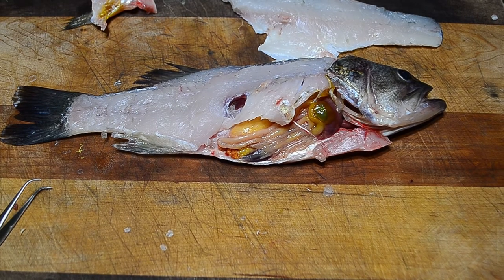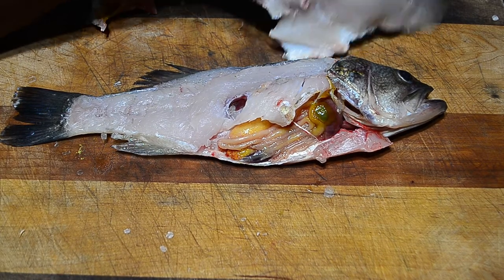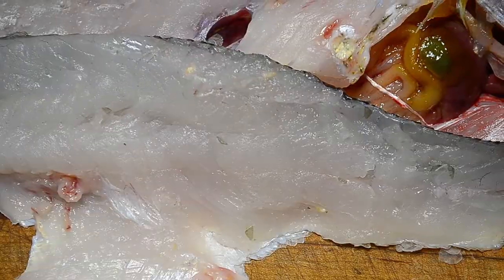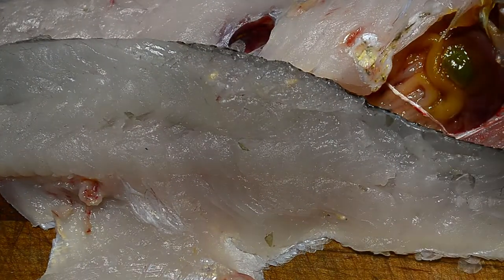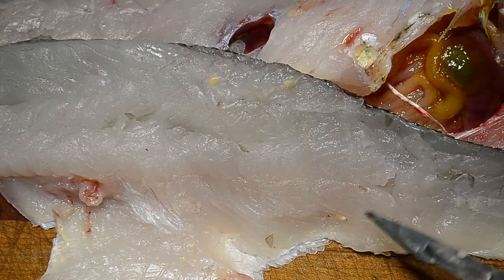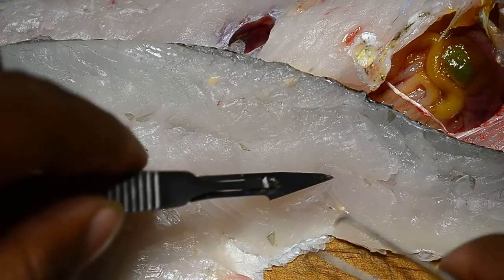One thing I want to show before we dive in is the parasites. I filleted this real quick and if you can see the yellow blotches — one here, another one there, another one there — these are actually parasites.